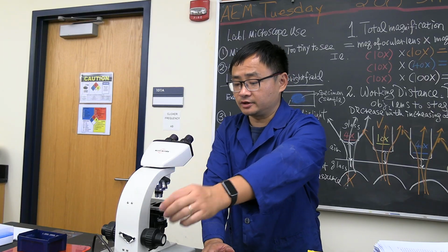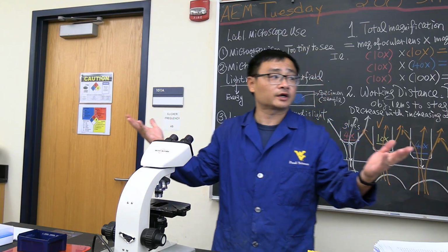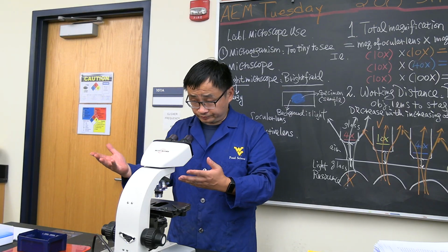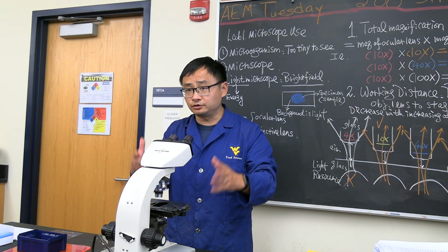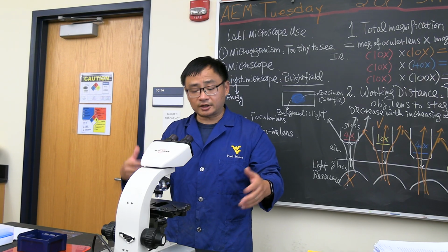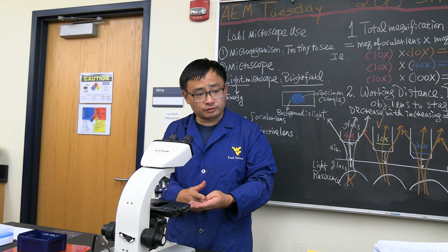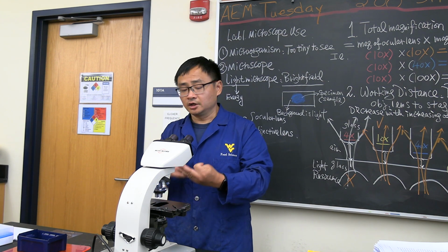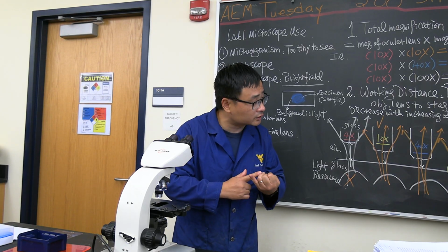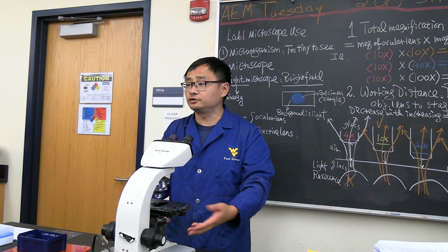I use this every time in the very first class as a demonstration, as a warm-up practice for using the microscope. I hope everybody going through today and Thursday will be very familiar and comfortable using the microscope, because it's a basic tool for microorganism research or anything, or teaching or demonstration. We will do simple stain on Thursday, gram stain next week Tuesday, endospore stain next week Thursday. Then we have unknown number 1. We are going to use the microscope. Then later on we have unknown number 2. We are again going to use the microscope.